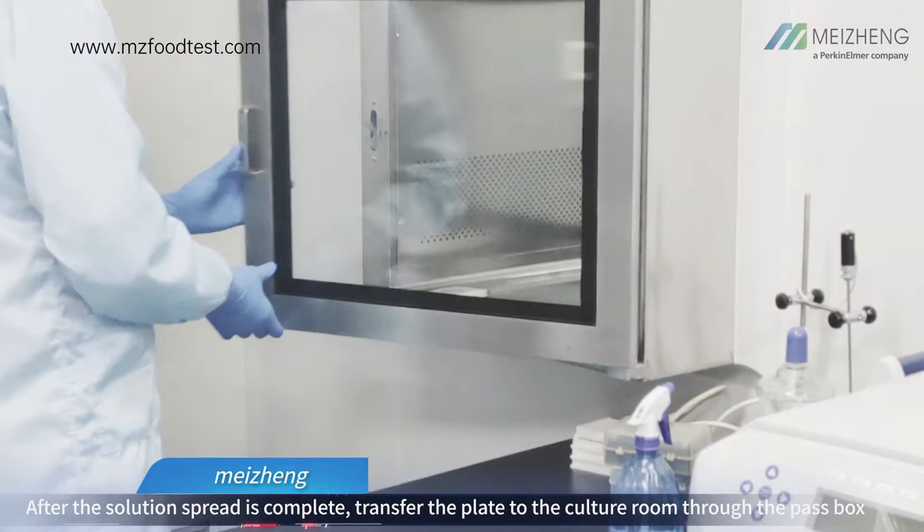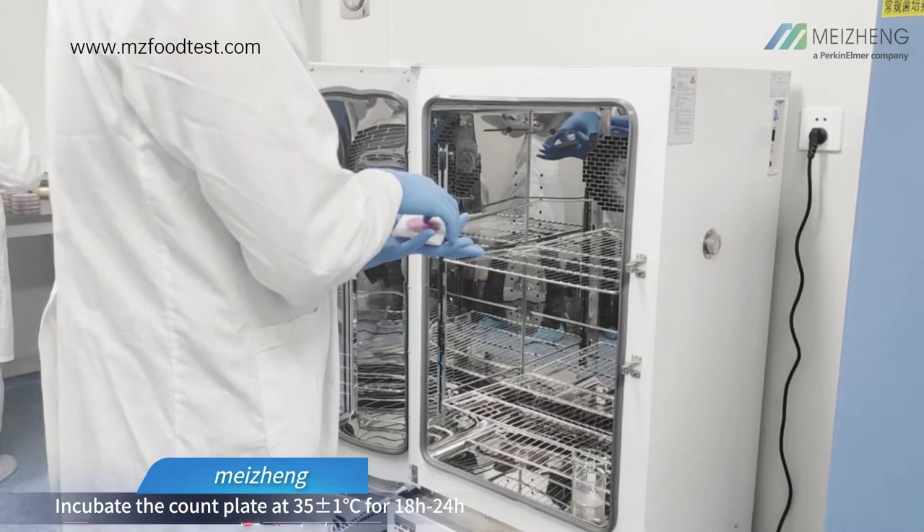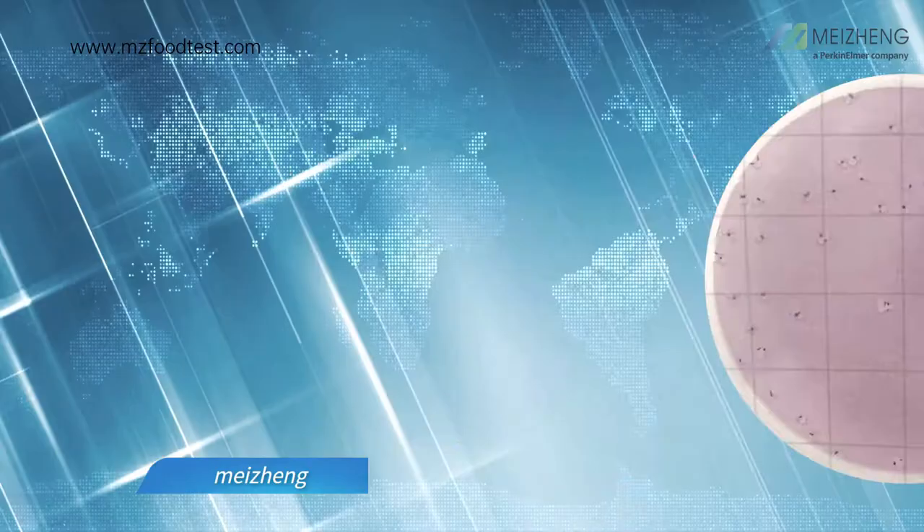After the solution spread is complete, transfer the plate to the culture room through the pass box. Incubate the count plate at 35 degrees for 18 to 24 hours with a tolerance of 1 degree. The count plates should be stacked upwards and no more than 20 pieces during incubation.